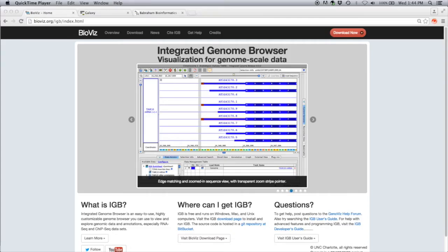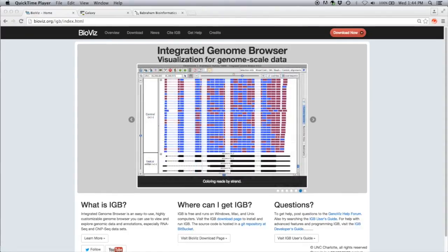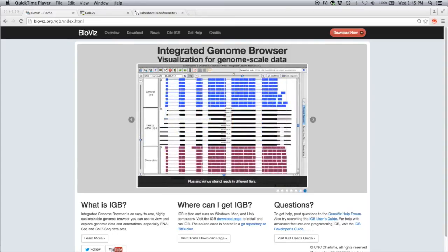Hello and welcome to another monthly Focus on a Feature online tutorial using the Integrated Genome Browser. My name is Dr. Nolan Fries and I will once again be your host for today. In the past couple of months we've covered analysis and visualization of some of the major whole genome next-gen sequencing experiments, things like RNAseq and ChIPseq. Today I'd like to cover another seq method: whole genome bisulfite sequencing.